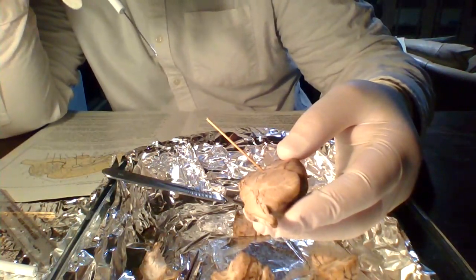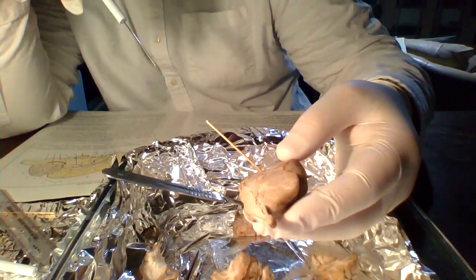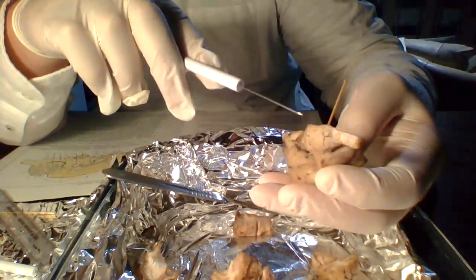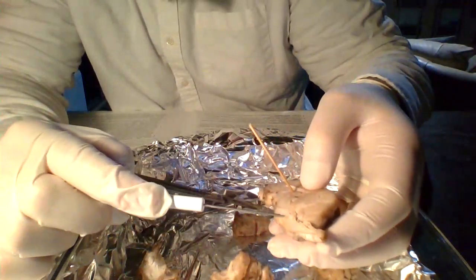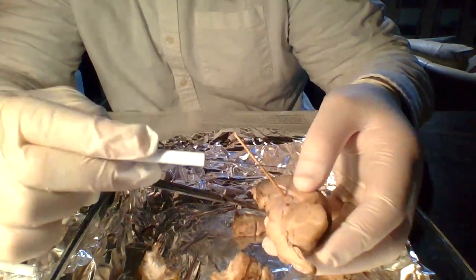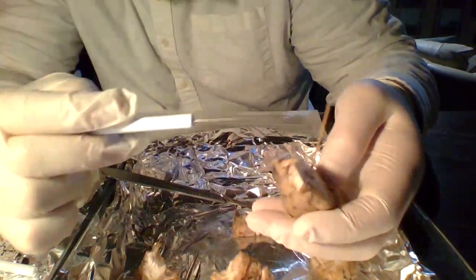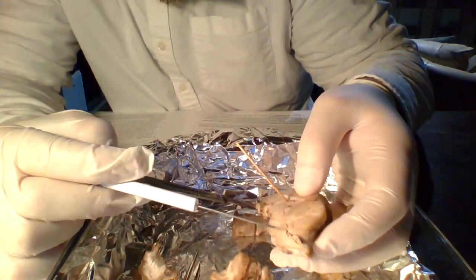Spinal cord. Well, you know what that is? The medulla oblongata, which would be here or down there. As you can see, it's still fused-ish. You can't even tell the difference between the medulla oblongata and the pons in this state without histology. It all just looked like one solid piece.